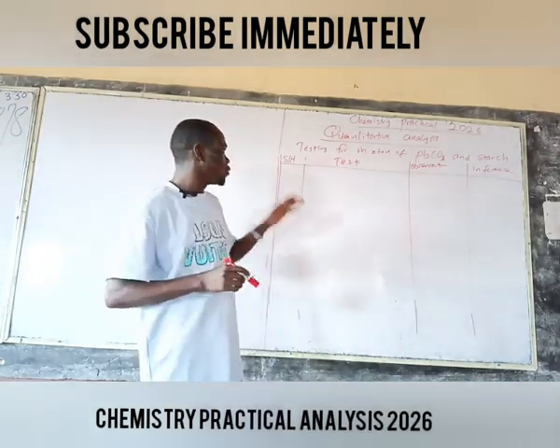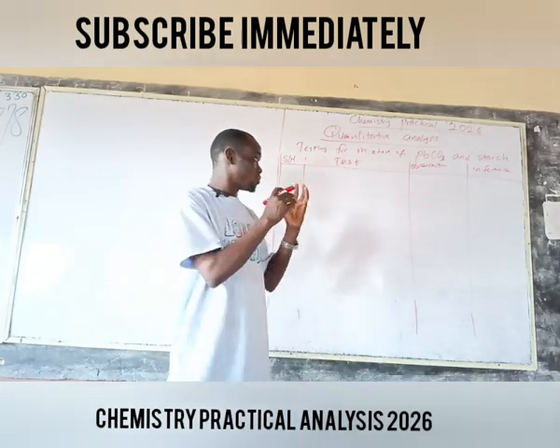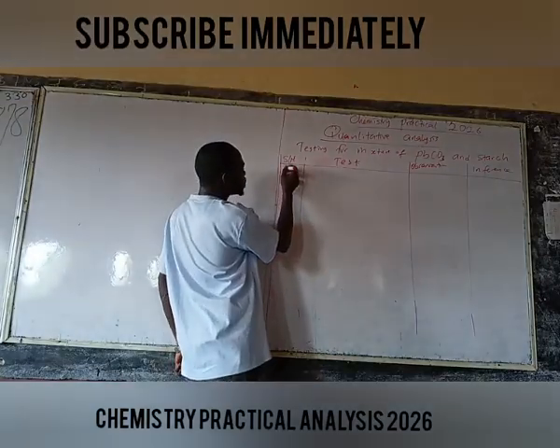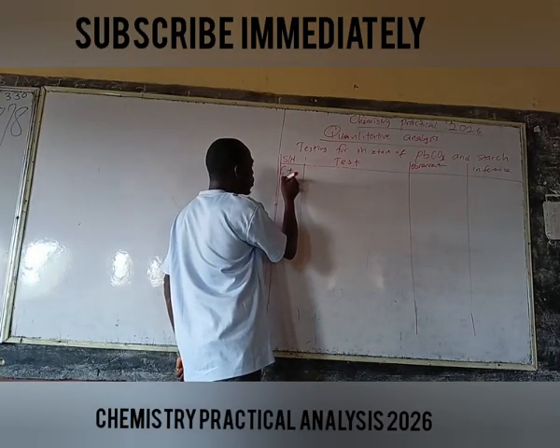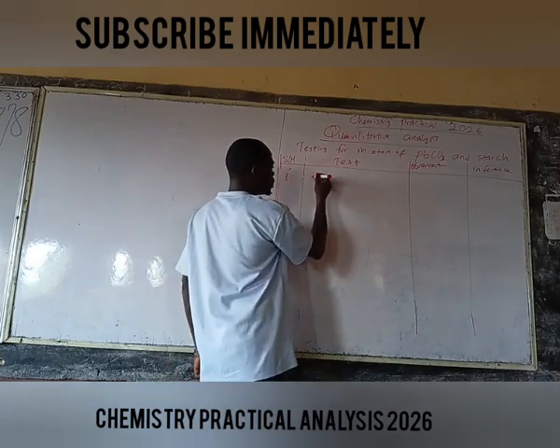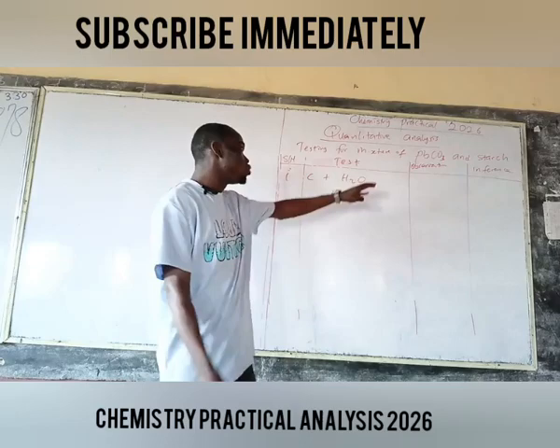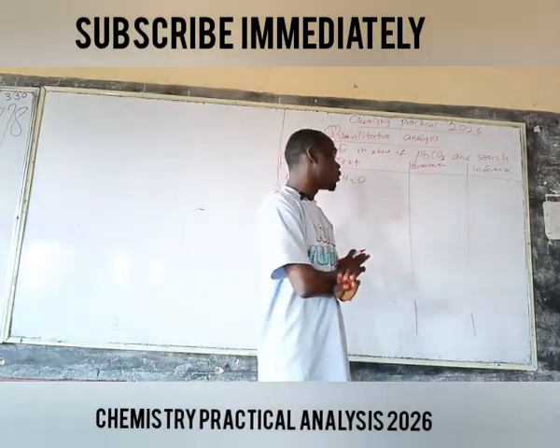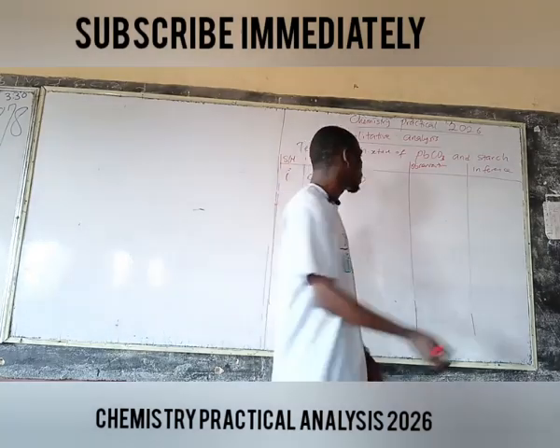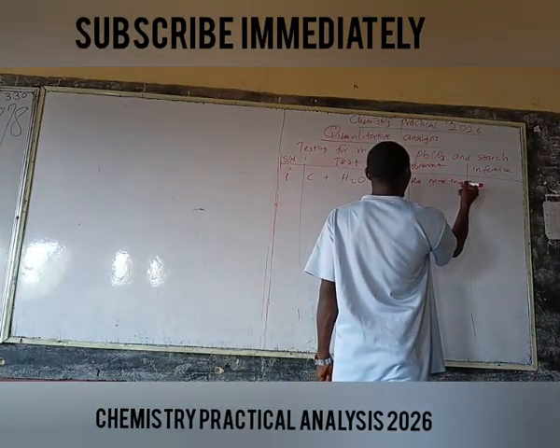To know this salt, the first thing is to dissolve it in water. So number one, you have C plus water. Then what do we observe? Already you must know that lead trioxocarbonate(IV) is an insoluble salt. Starch is always insoluble. Starch will never dissolve in water. So you say the mixture is undissolved.